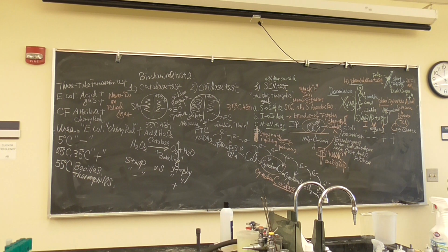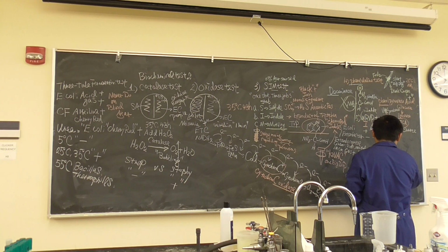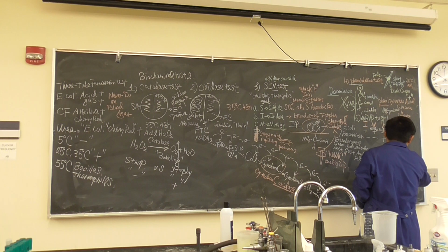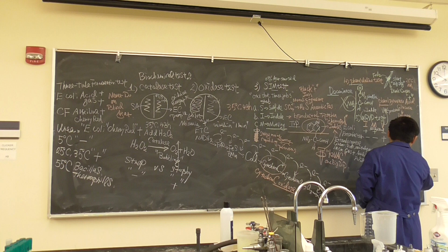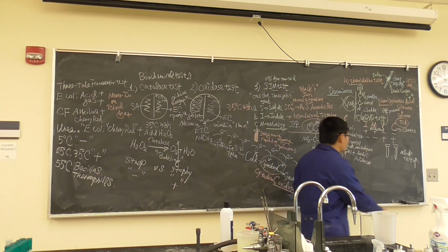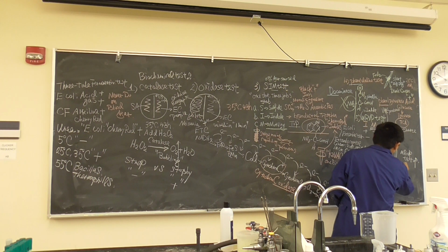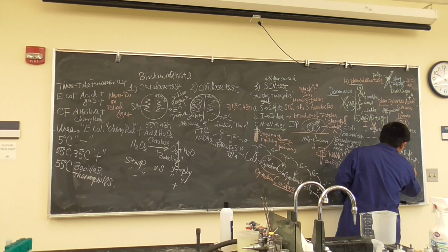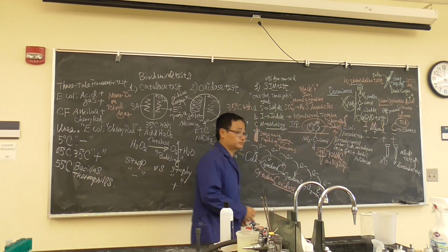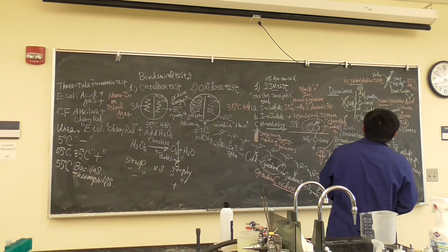So what are you going to do today? Very simple. Everybody gets one MRVP test tube. You inoculate E. coli, and your bench partner inoculates Enterobacter. Now, let me make your life easy.